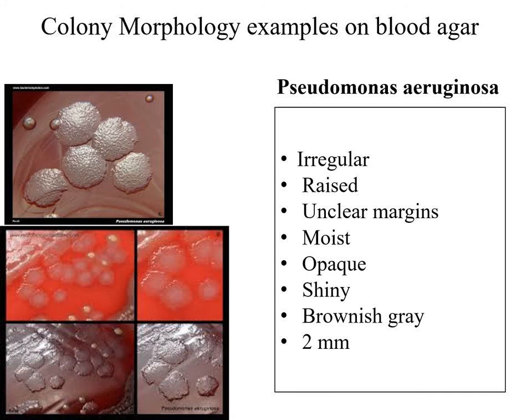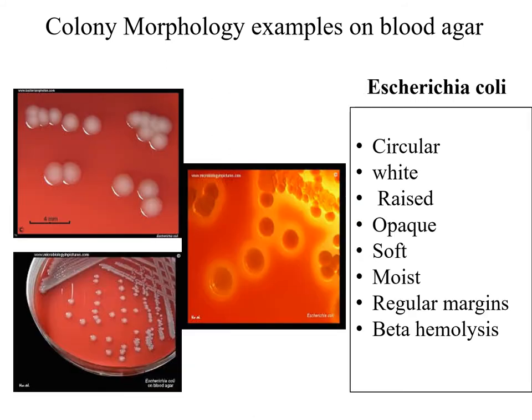In the next slides, we show examples of colony morphology on blood agar. Here is Pseudomonas aeruginosa: the colonies are characterized by being irregular, raised, and having unclear margins. They are moist, opaque, shiny, and brownish-grayish in color. The size of the colonies is around 2 mm in diameter.